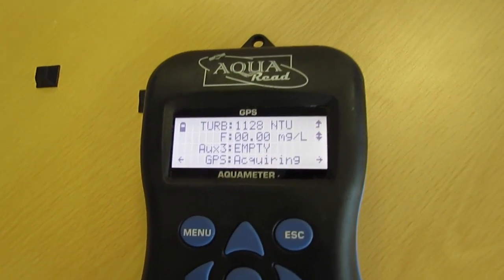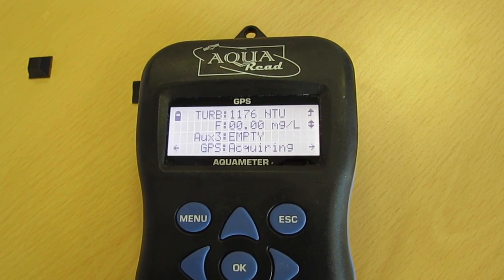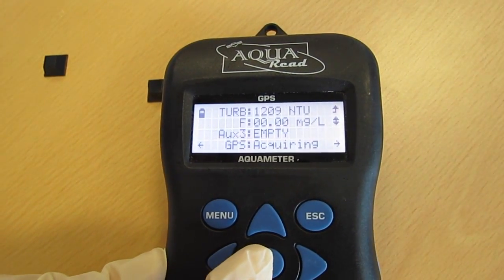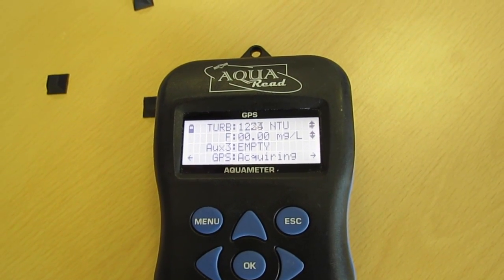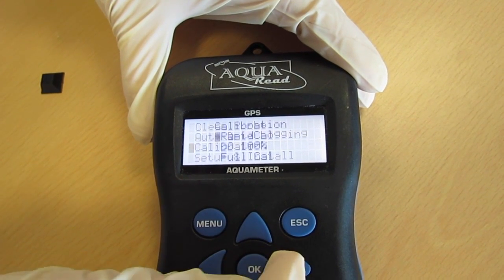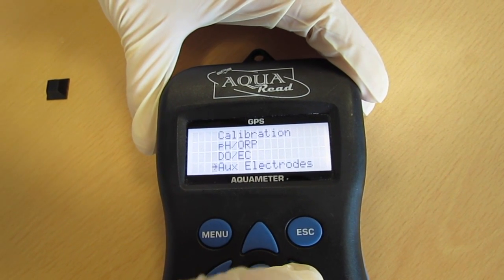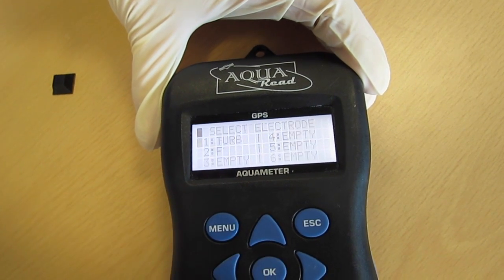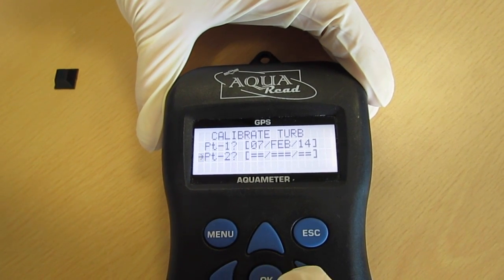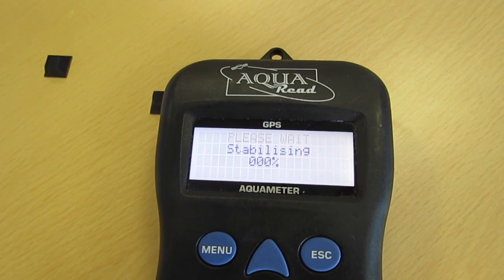Allow the turbidity reading to stabilise. Then press menu, go down to calibration, full cal, aux electrodes. Press OK on TURB — you can see point one was done in the rapid cal. Press OK on point two and that will stabilize and calibrate at point two, the 1000 NTU point.